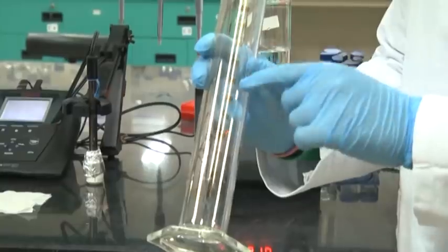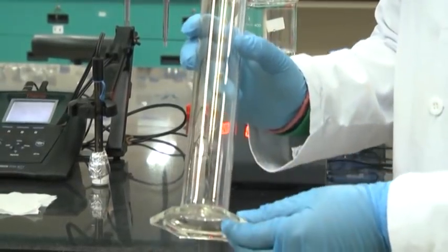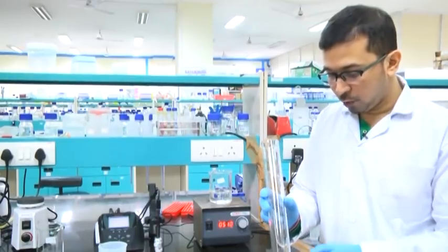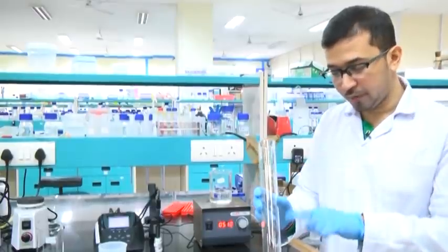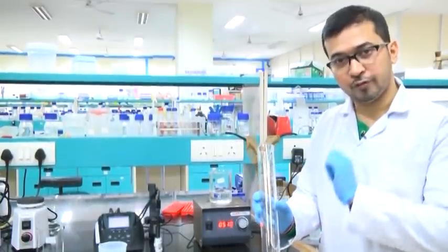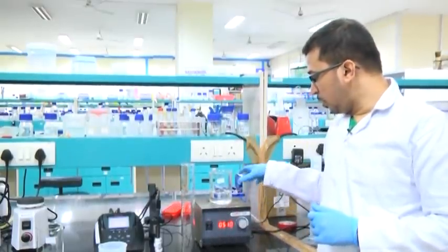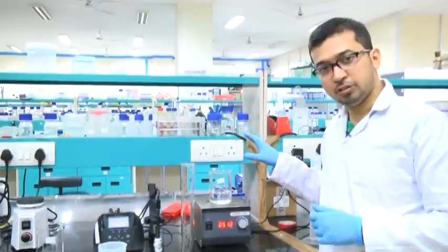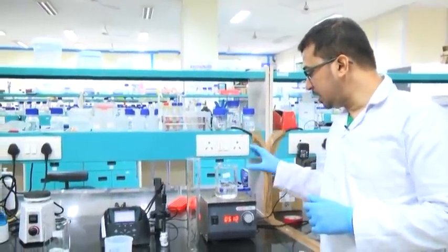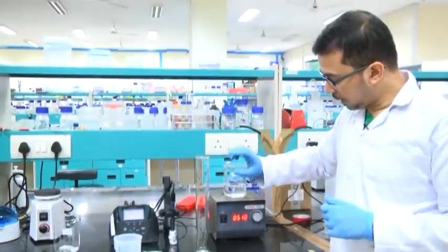Here we can see the graduation from 30, 50, 70 up to 190 and 250. We have to pour this solution into the measuring cylinder and adjust the volume up to 250 ml. We have to check whether the solid components are completely dissolved. Here we can see the solid component is completely dissolved and we can stop the magnetic stirrer.